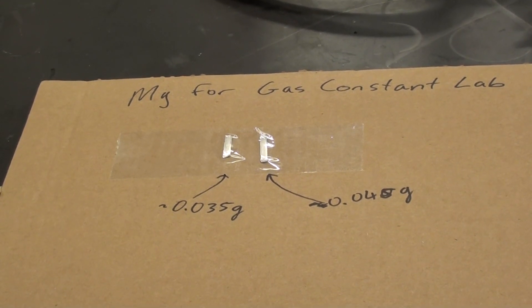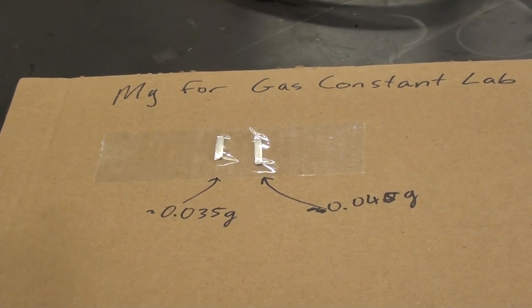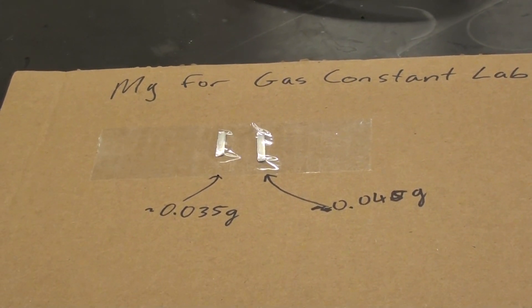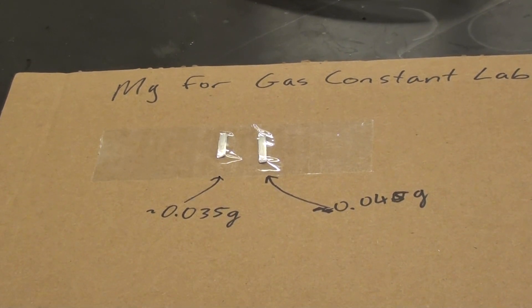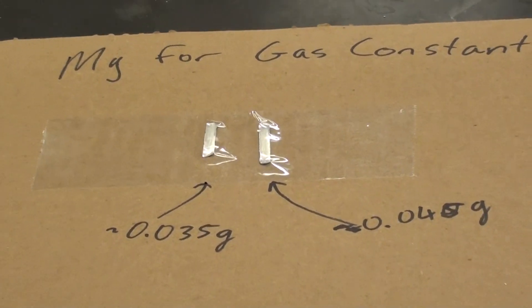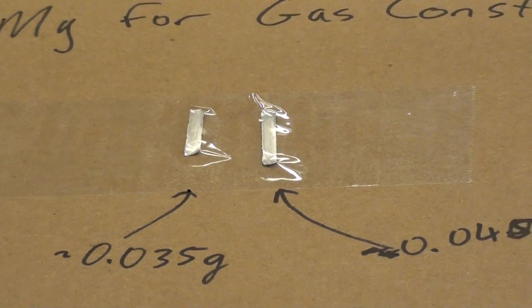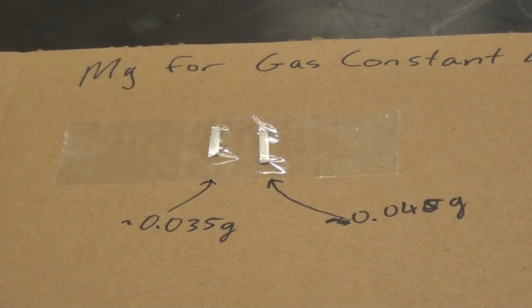This is a setup for the gas constant lab. The first thing we'll be doing is measuring out a piece of magnesium. I've got attached to this cardboard a length of magnesium that weighs about 0.035 grams and another one that weighs about 0.045 grams. We want the mass of our magnesium to be somewhere in between there, ideally somewhere in the 0.040 gram region.